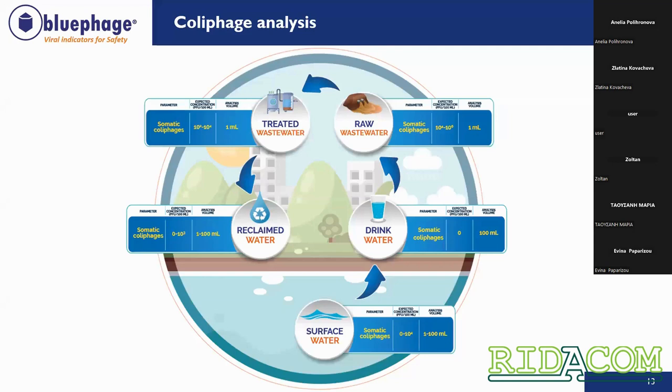And the same, as you can see in treated water, we also have between 10 to the 2 and 10 to the 4. So we will be analyzing 1 mL.